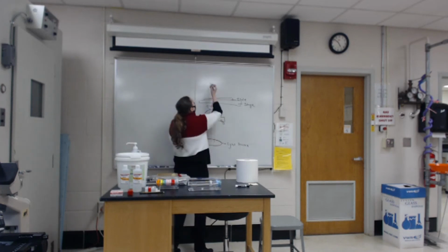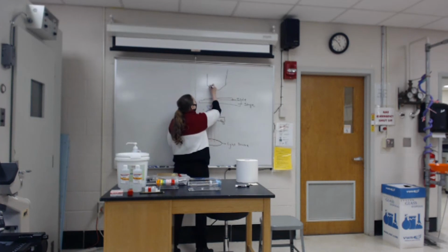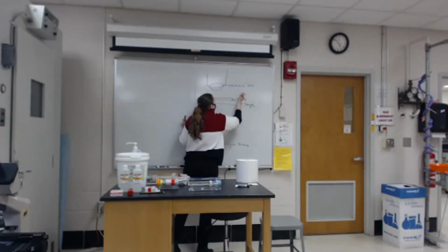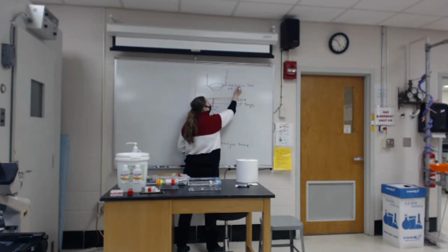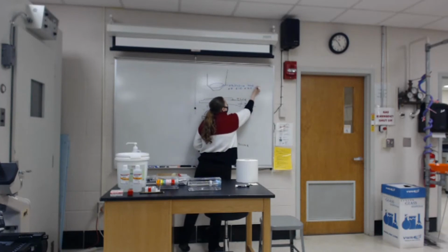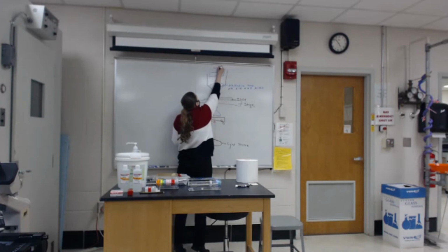Above the slide, we're going to have our objective lens. Here I'm just drawing the pipe that it's located in, and we're going to have a few lenses in here. That's going to be the scanning power, low, high, and oil immersion. The options are: scanning will be 4x, low will be 10, high will be 40, and oil immersion will be 100 magnification. There's another lens above this, and then eventually the ocular lens.